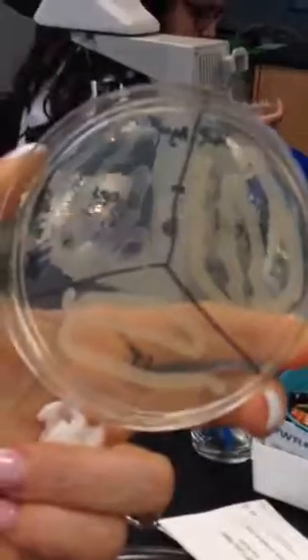White, and they have kind of an irregular edge. What do your salmonella look like? They're also white and have kind of an irregular edge. Your staph epidermidis, those are also white, but there's much less growth. They didn't grow very well.